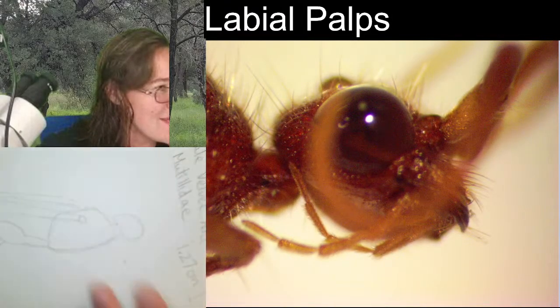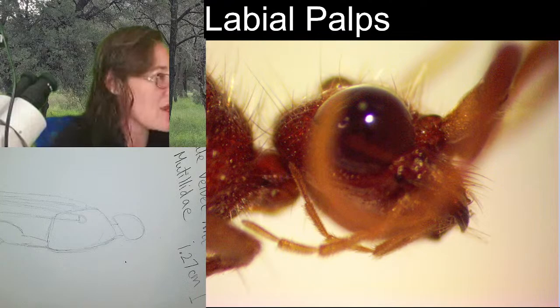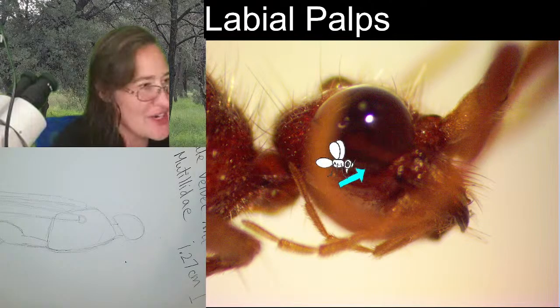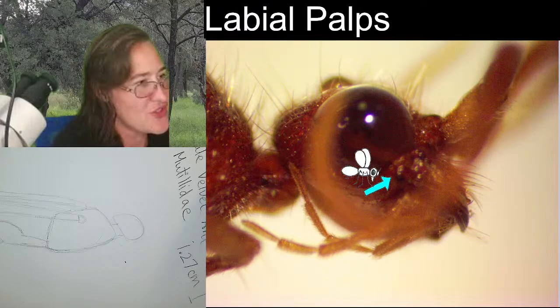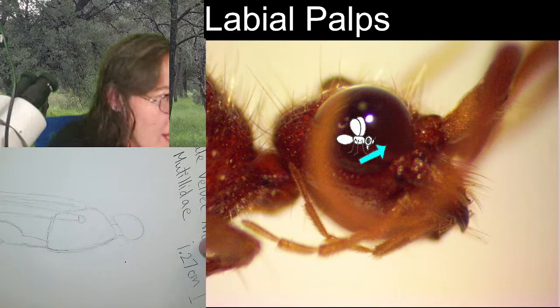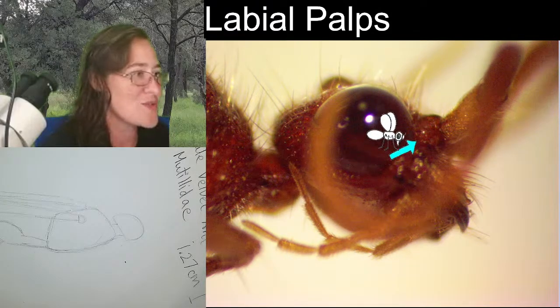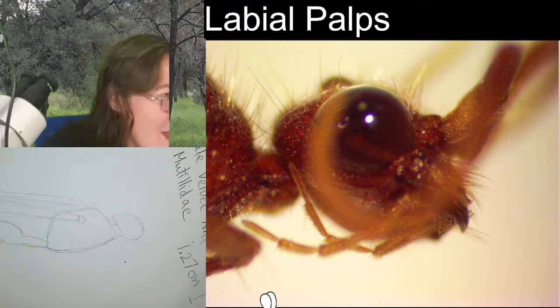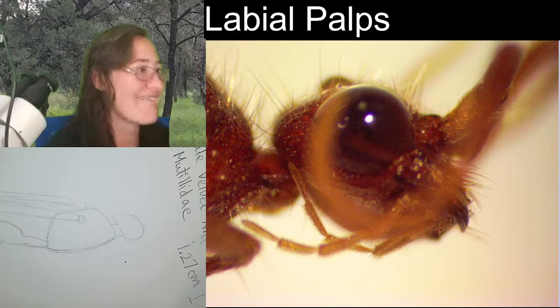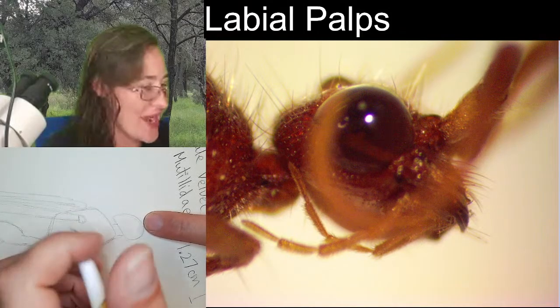All right, so there's one thing that I want to point out before we really start diving into this one. I know likely you all have already, but you notice how there's a part of me that just wanted to make this compound eye circular, but there's this region right here that kind of comes in, has a little bit of a concavity to the compound eye. This right here, and then down to this point, that's the mandible. It backs up almost all the way to the compound eye. That's fun.